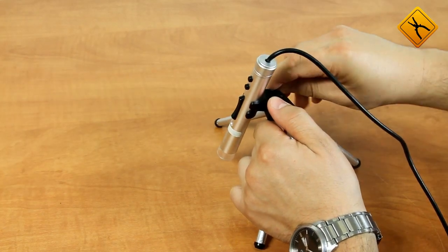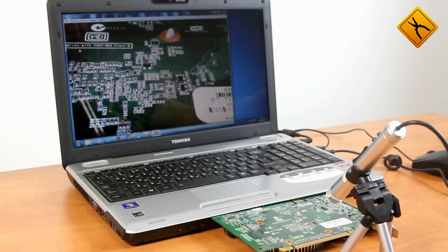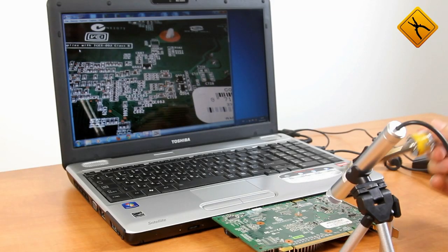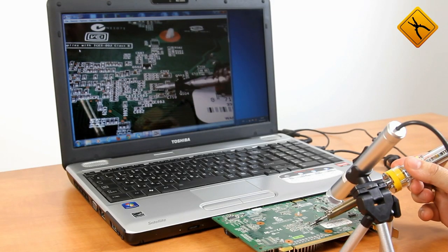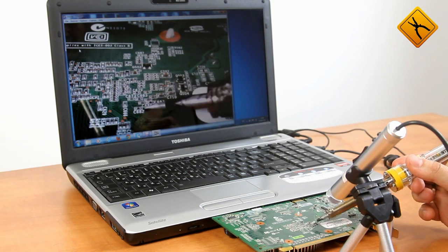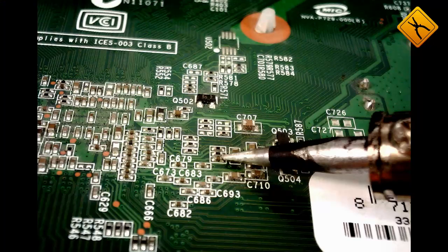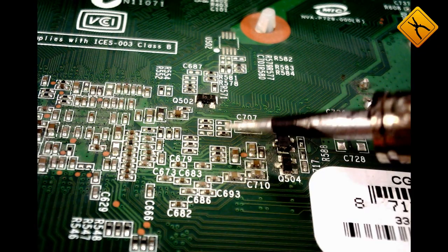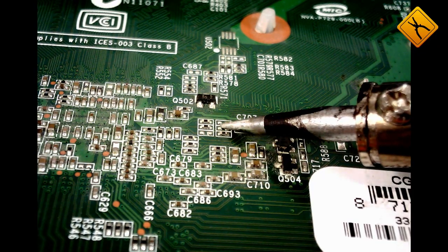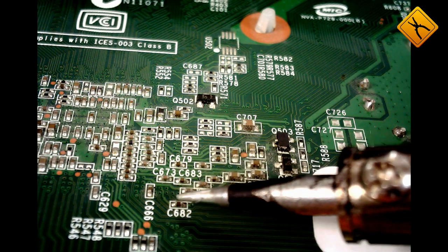Now let's see how it works. We'll check the video capture mode first. You can use the default SuperEyes software or an alternative, as I do now. Microscope resolution is set to 2 megapixels, the maximum.